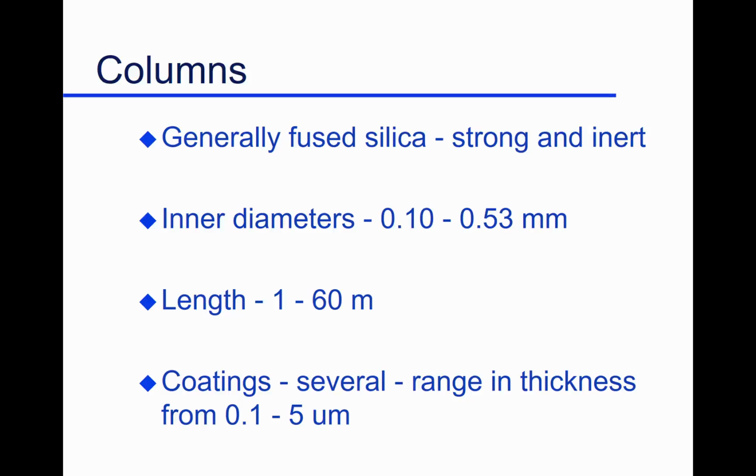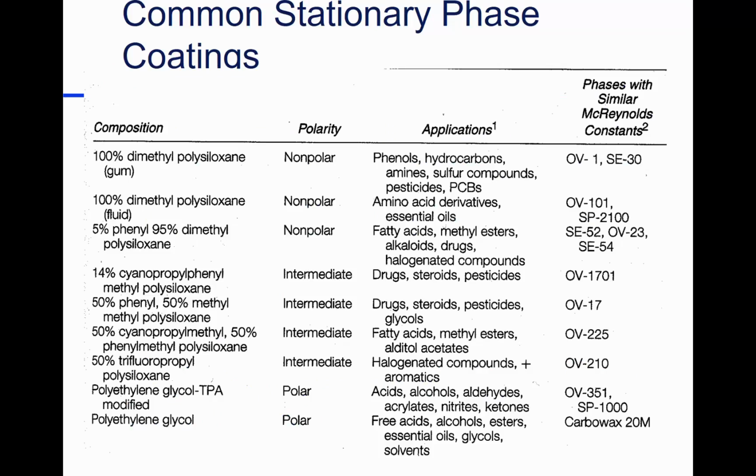We typically work on the lower end of it. So very, very thin coatings on a very tiny column. The fact that it's flexible has a great deal of value to us. We used to take big glass columns and try to connect them to stainless steel. One out of 5 times it would break. Connecting glass to any kind of metal is a problem.